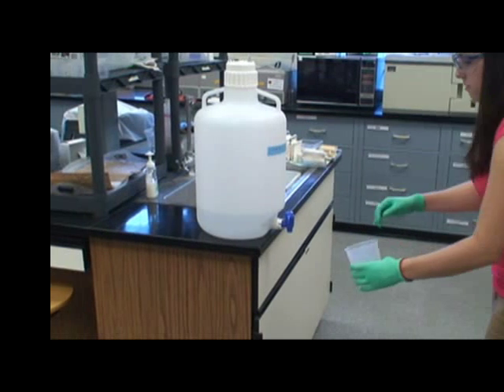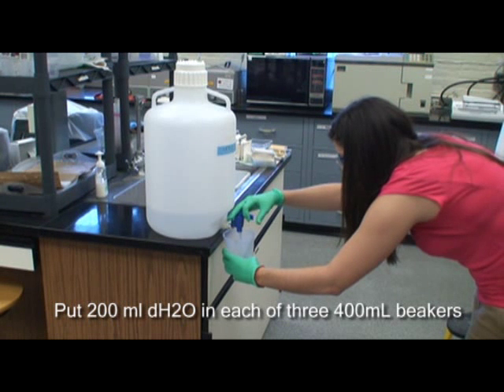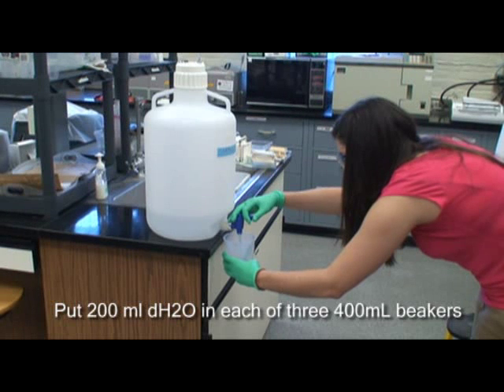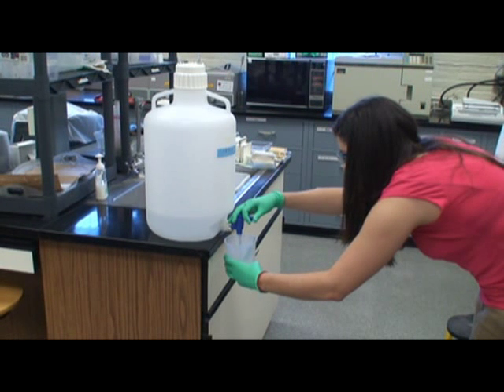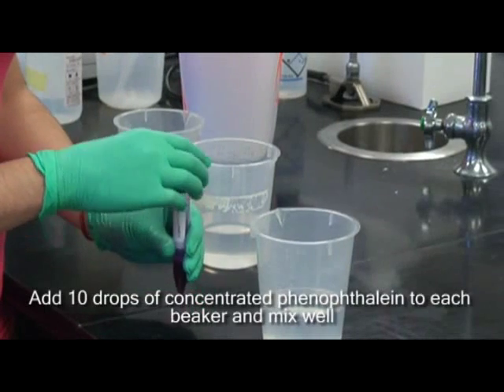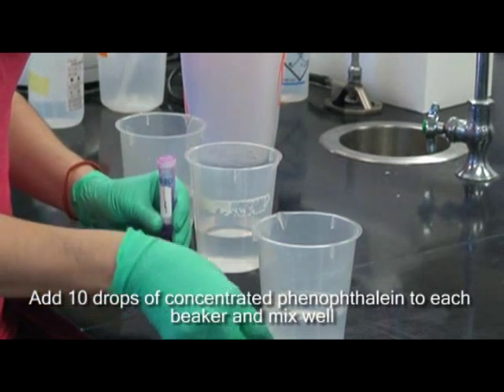To begin the experiment, first put 200ml of distilled water in each of the three 400ml beakers. Add 10 drops of concentrated phenolphthalein to each beaker and mix well.